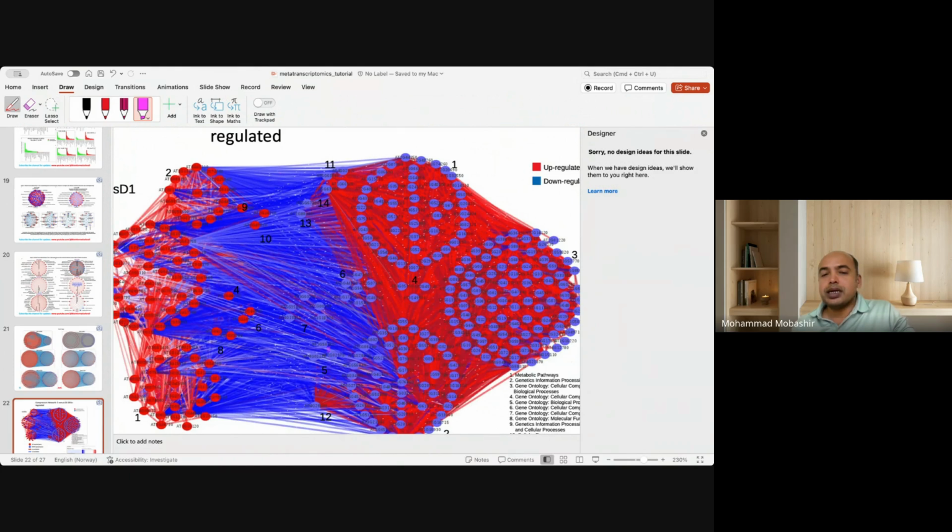So the clustered genes and these links are showing the interaction between different up and down regulated genes, and the thicker length and higher deep color for red means a strong co-expression values, or you can explain it in your own way.